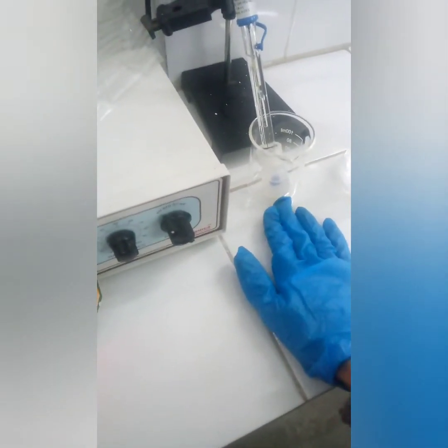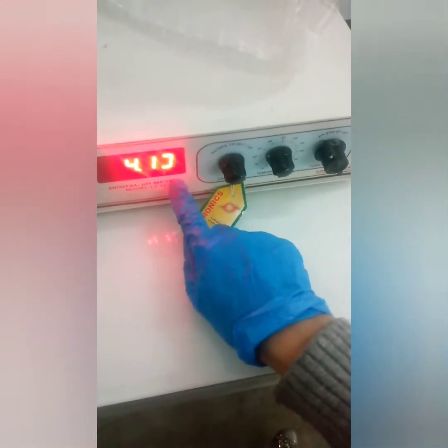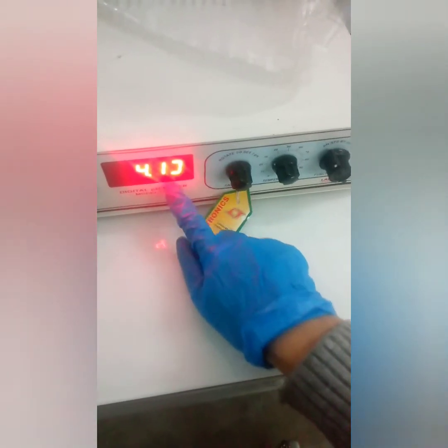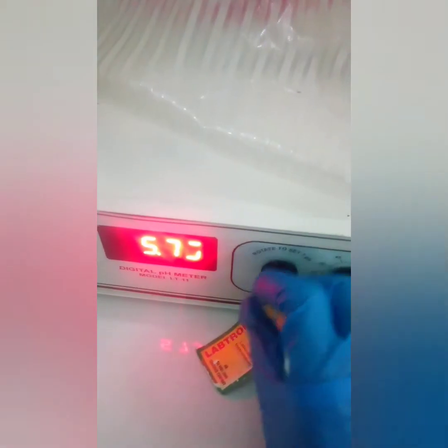So we will use a water sample here, in order to correlate it with the instrument. We know that the pH of the water is 7, so we will calibrate this pH meter at pH 7. So first we need to calibrate. So I am taking distilled water here. First of all we will calibrate this instrument.